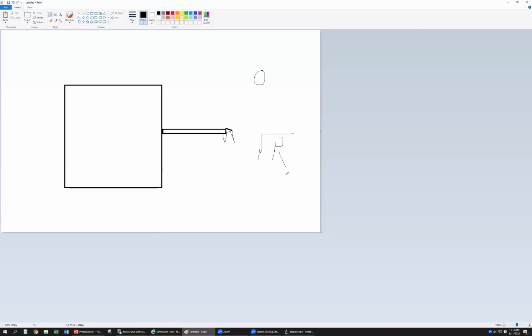So we are calibrating the tip radius because we don't know the radius of the tip. You can get the tip radius on the website, but it's nominal data. It's not accurate. That's for the new probe. But for this kind of already used probe, you never know. So that's why you need to calibrate. Once we calibrate it, the next time we use it, we just input the data.